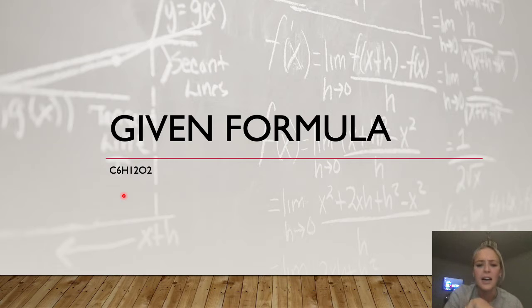So I'm probably not going to have an aldehyde or just a plain ketone or an alcohol or anything, or especially not an amide or anything like that, because I don't have any halogens or nitrogens. I know I'm just working with carbons, hydrogens, and oxygens, which narrows down my functional groups a lot to try to figure out what I'm looking for in my spectrums.